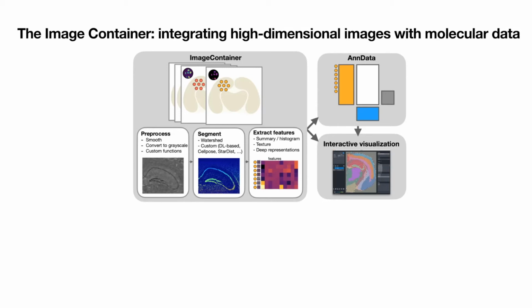But actually for all of this, maybe before I go on, I want to mention that this is something that we're currently in the process of redesigning, and I will say more to this in the end. So I know that with the image container there are some issues and some things are not as seamless as they should be, and this is something we are currently in the process of standardizing, also with the rest of the community using images, and especially histological images.